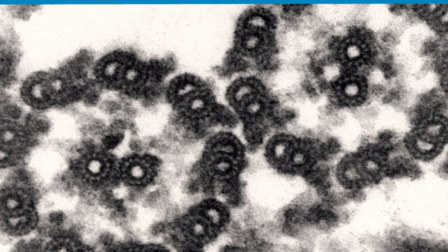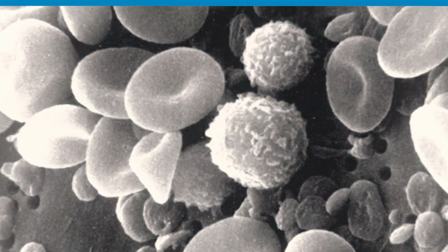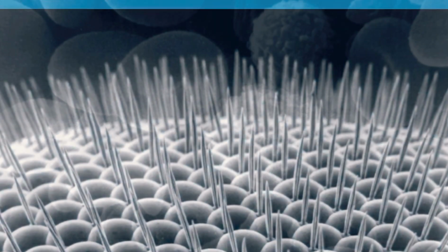Different parts of the sample bind the heavy metal ions to different extents. Heavy metal ions scatter electron beams and thus cause dark areas on the image.